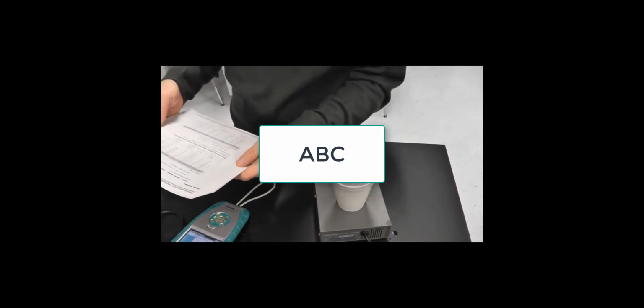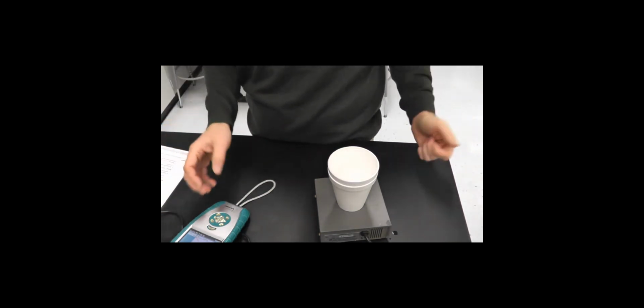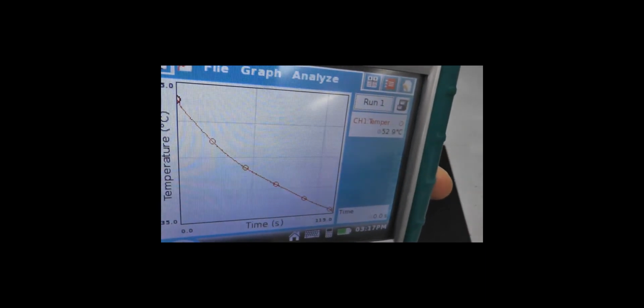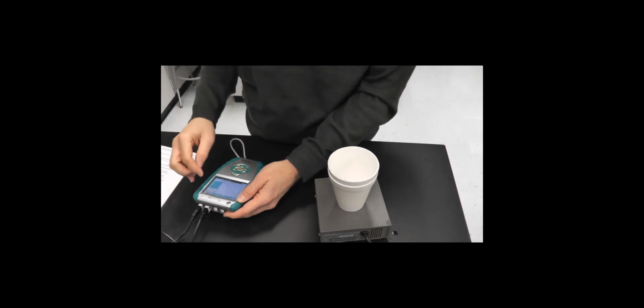What's going to end up happening is I'm just going to tell you what T-mix is, I will assign a T-mix in your data for you. But that's kind of what you would have gotten, that slope that's not exactly linear. So you would do a line of best fit and find where it hits the y-axis. Okay. And then you're going to do calculations based on T-mix.